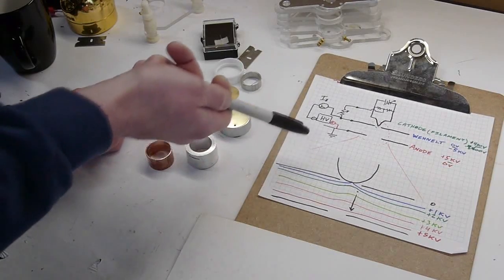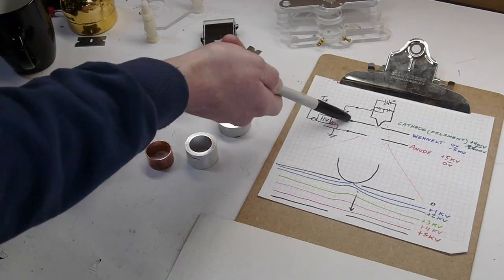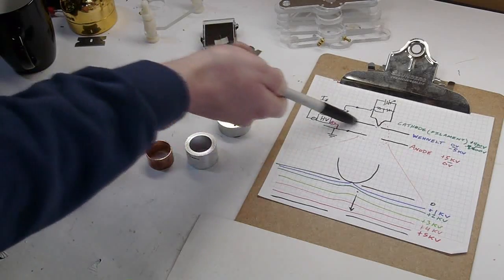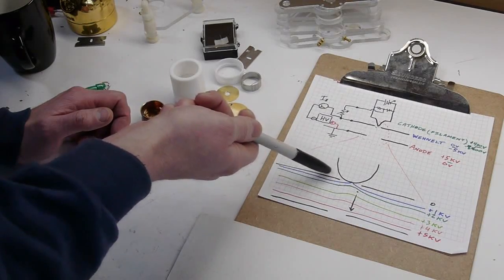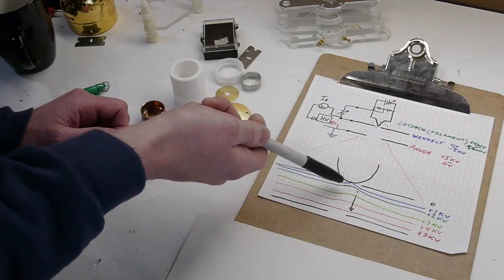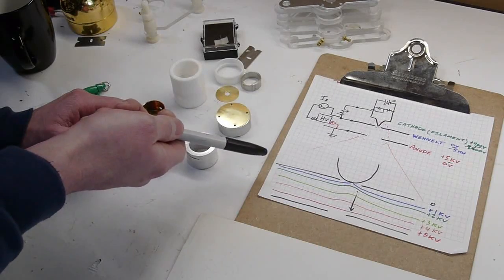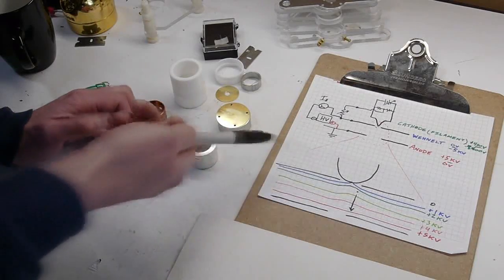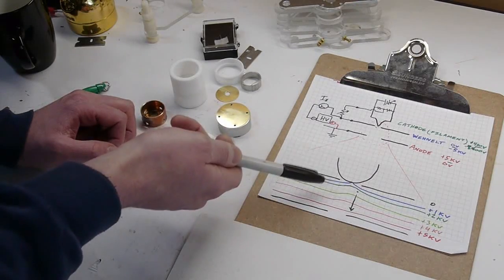So let's say we did have a value here. Let's say it's zero, actually. Let's say we shorted this out. That means that the filament is always going to be the same potential as the Wenelt, because this is a short. Now what's going to happen? Now these field lines would be very flat. In fact, they would not be drawn the way that they look now, because this is all the same potential. So you just have straight field lines running across here. These are actually equal potential lines that just show the shape of the field. So any electrons that are boiled off in that case, all of them get accelerated pretty much, or any of them that make it down into this area.